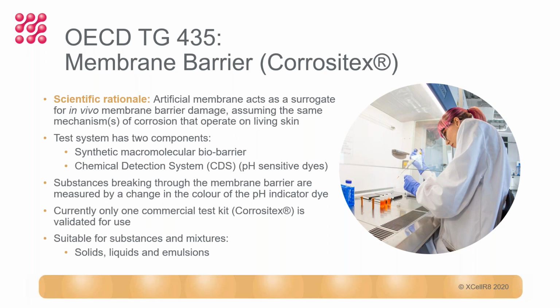The test system has two different components. There's the synthetic macromolecular biobarrier, and there's the chemical detection system, which consists of a series of pH sensitive dyes. It's quite a simple system just to look at how a chemical manages to break through the membrane barrier, and then you would measure a change in the colour of the underlying solution and match that up with a chart to show the amount of breakthrough that has been seen.